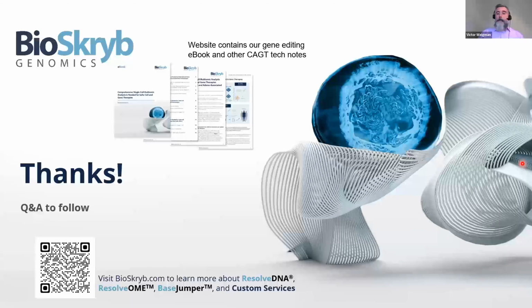Absolutely, yeah. So for this, we did leverage the tool Cas-OFFinder. It's been around for a while. Since running this experiment, we found three other ones that we're looking to try. It won't be at the poster in two weeks, but how you choose those becomes a little bit more than just searching, making the chains and aligning on the genome. But we allowed here seven potential mismatch events for every 15 base protospacer, which is a lot. That's almost half, right? So we allowed a lot of variability, just to assume the algorithm has the best possible chance at finding things, right? Insertion here, deletion here, across all the other methods.